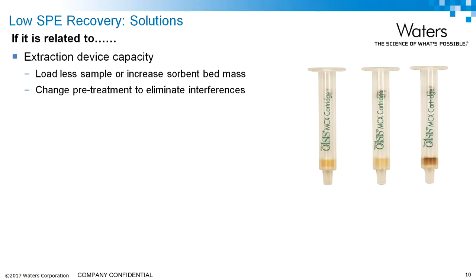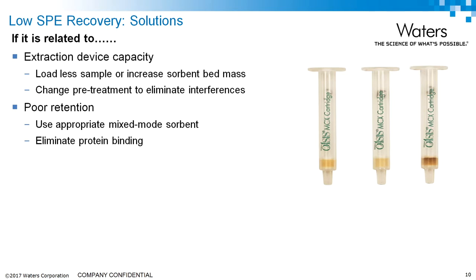Let's talk about each one of these problems and some potential solutions in more detail. For device capacity, one obvious solution is to load less sample or increase the bed mass. Another solution is to change the pretreatment — for example, if you do a precipitation prior to SPE, you can eliminate high abundance proteins, effectively increasing your capacity for the analytes of interest.